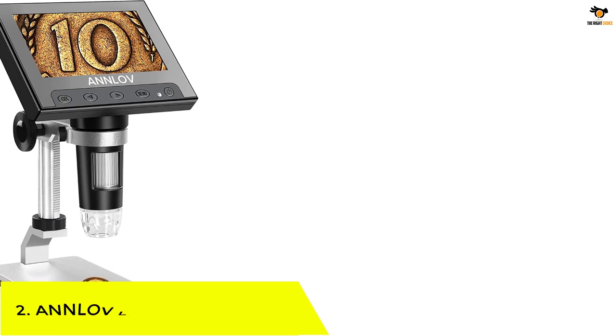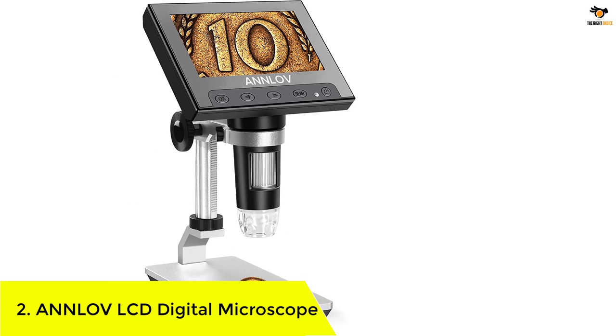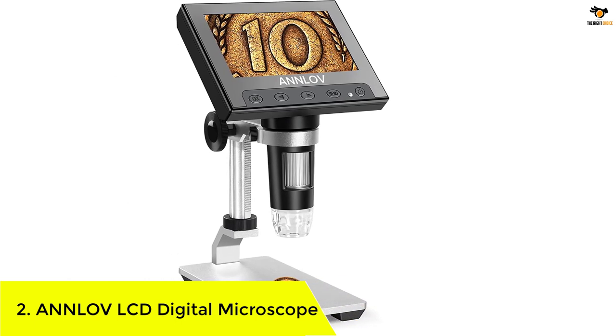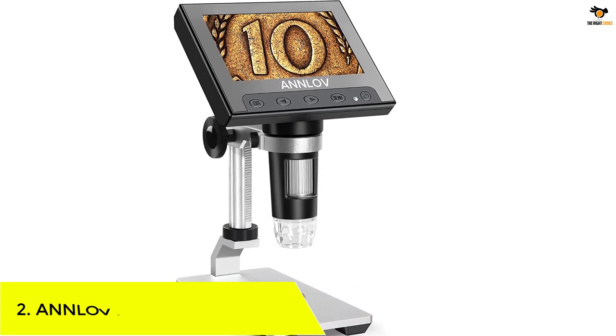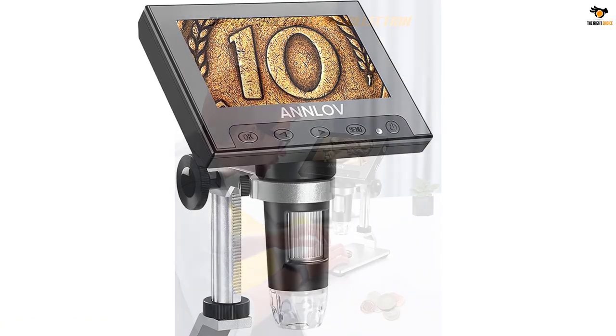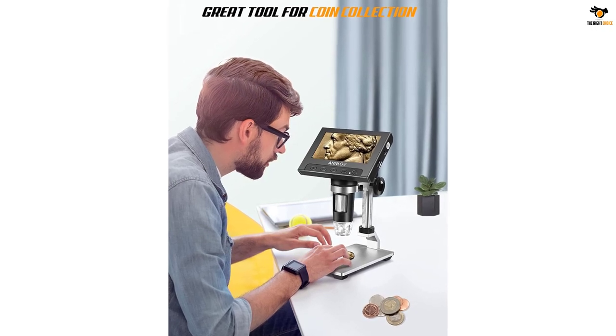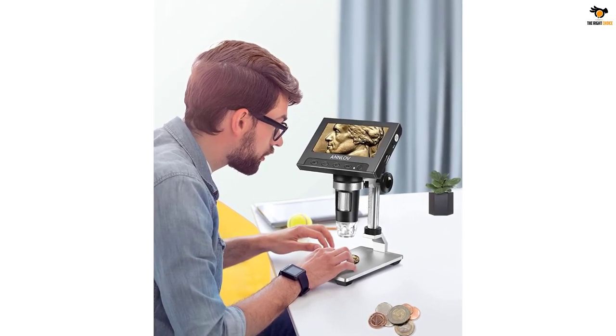Number 2: ANNLOV LCD Digital Microscope. The LCD Digital Microscope by ANNLOV is an absolute game-changer. It has a 4.3-inch LCD display, which helps to observe specimens with a mind-blowing 50x-1000x magnification.